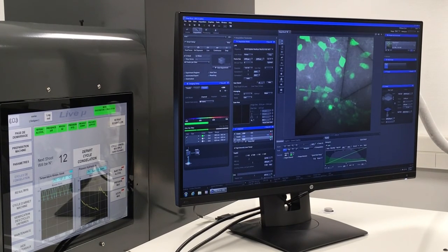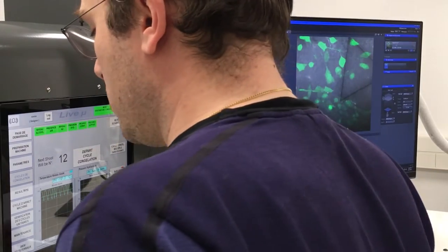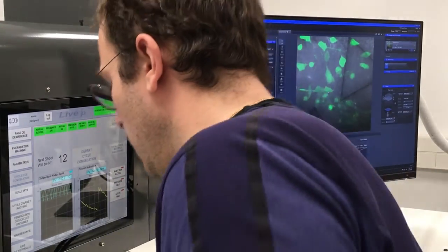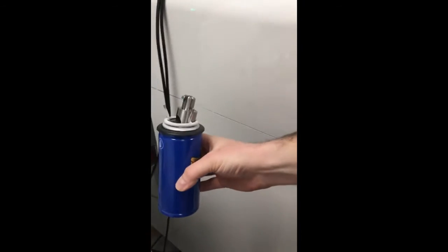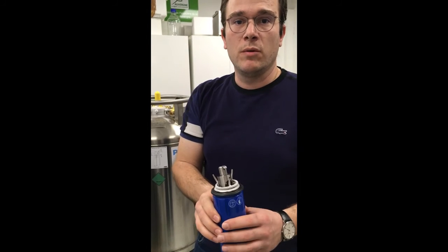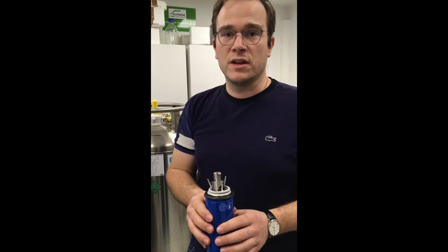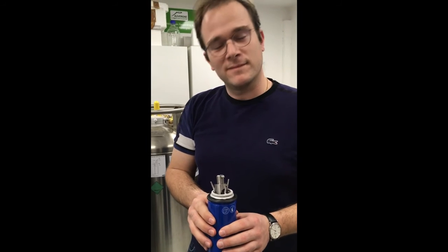Once you've identified the sample of interest, just use the system and high-pressure freeze. The sample is restricted. Now we can continue with the sample for high-pressure freeze substitution or cryo imaging depending on your scientific question. Thank you!